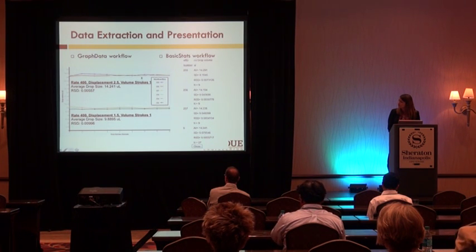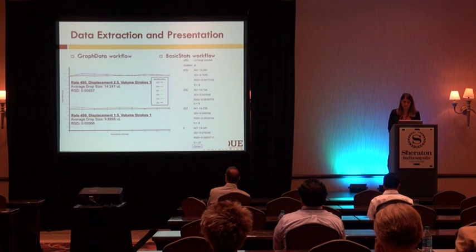Here our aim is to see how reproducible the drop generation process is in between different runs. And so we use the basic stats workflow to calculate the average drop volumes, the standard deviations, and the relative standard deviations associated with these runs. And you can see that you can record the experiments very easily and then later on use that information.